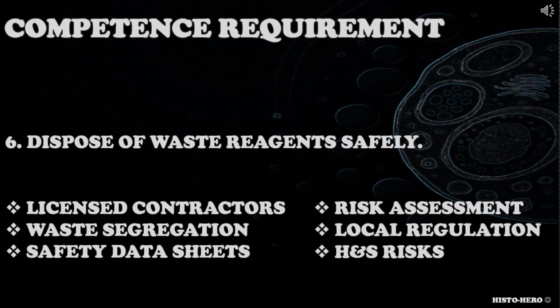The sixth competence requirement is dispose of waste reagents safely. Candidate should be able to safely dispose waste reagents. Does the candidate dispose staining reagents safely? Do they follow local procedures and avoid risks associated with staining reagents? Do they segregate waste as per regulations?